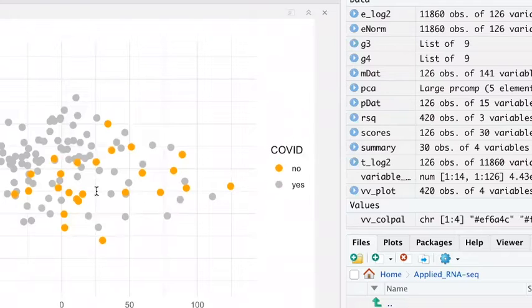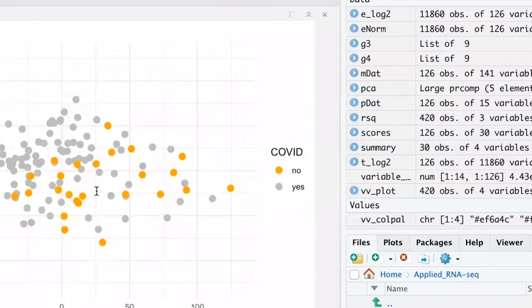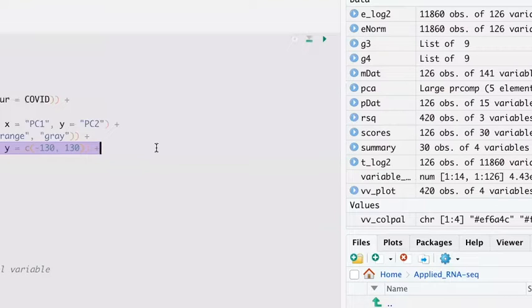Yes. Sorry, since that command is not... Uh-huh. Yes. It's right here. There are different ways of doing this as well. You can set it using a different argument, but this is the one I like to use. Did that work? Okay, perfect.